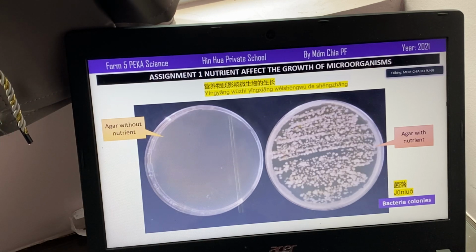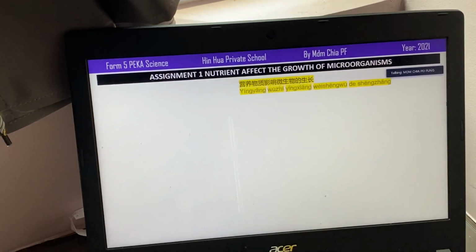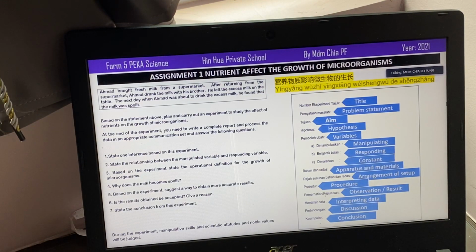Okay? So at the right side the petri dish you get to see the agar, you form all the bacterial colonies in white spot. So bacterial colonies 我们叫做菌落。So how to know that with nutrients bacteria can grow well rapidly? Just calculating the number of bacterial colony present on the surface of agar. 所以那个就是我们的反应性咯，你们明白吗？所以类似是这样子，老师只是大概给你们讲。所以呢，from this situation, the question, the assignment 1, your report you will have to follow this in sequence.